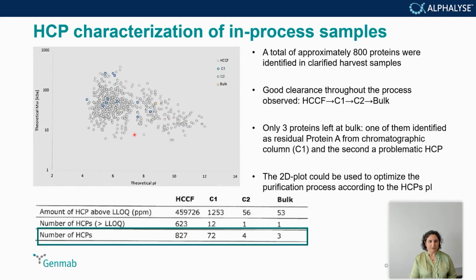One thing I would like to say is that knowing the PI or molecular weights of the HCP proteins aids in developing a purification process in order to remove them.